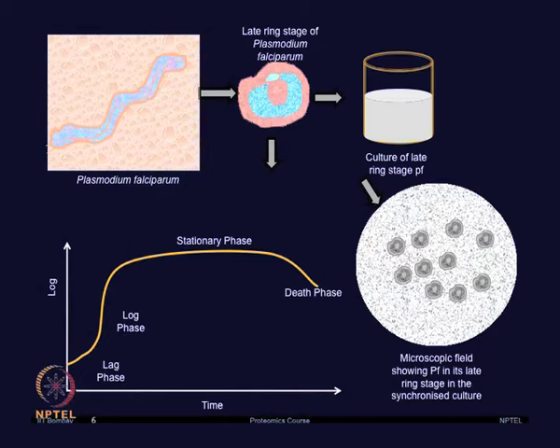The effect of these drug concentrations on parasite growth over 24 hours was characterized, as you can see in the growth curve on the slide. Synchronized ring stage parasite cultures were harvested over a 24 hour period after exposure to ARM and LUM. The parasite growth was determined using a hypoxanthine uptake assay.